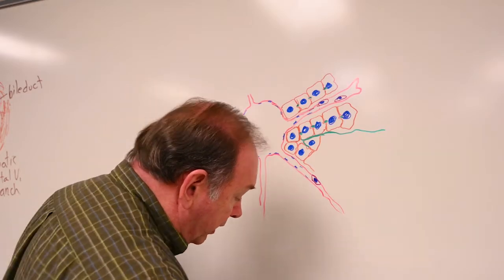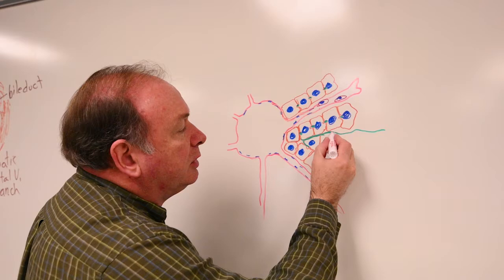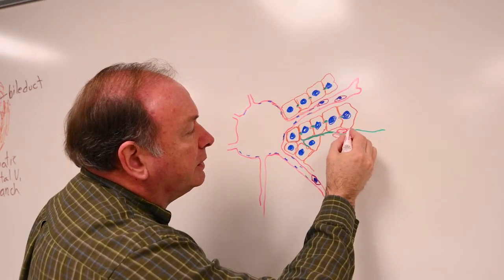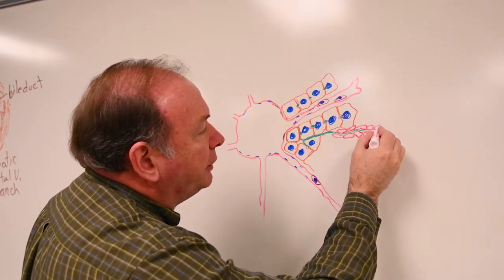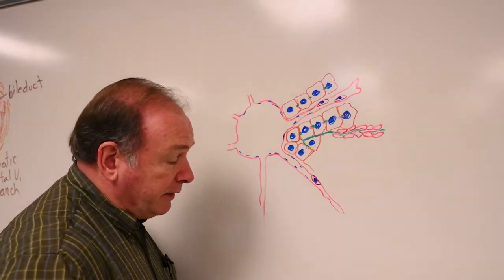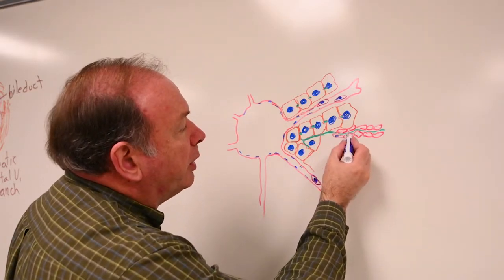perimeter. Often before we reach the perimeter, however, we get into a place where there are cells that form a boundary around this flow path for the bile. This is a bile ductule, also known as the canal of Hering. So these are small cuboidal-like cells.